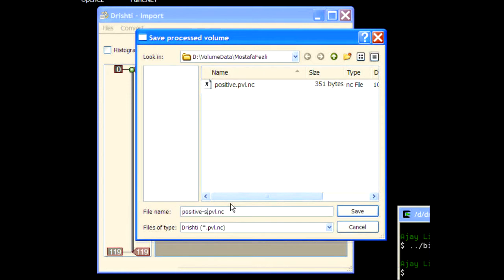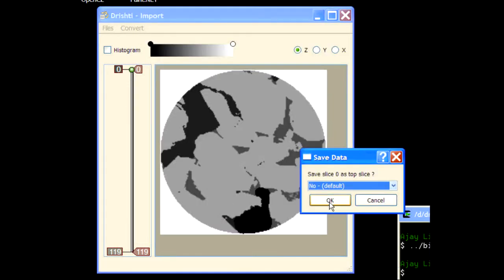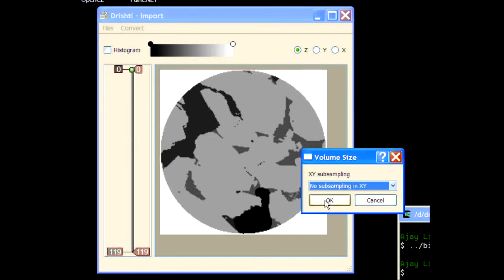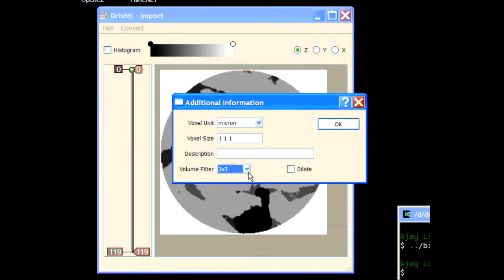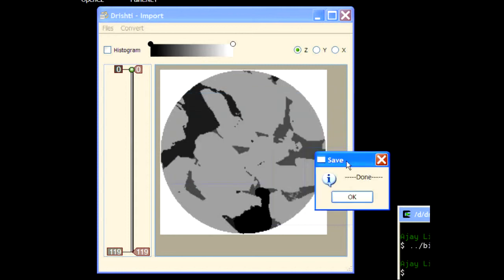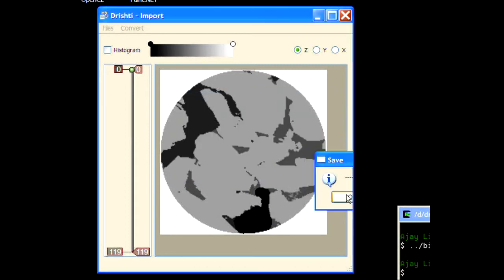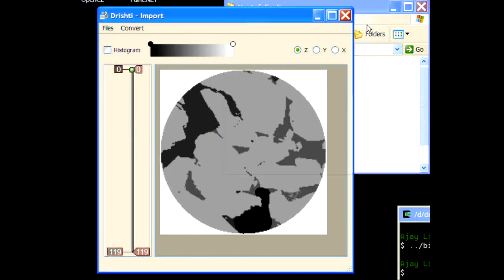Save positive, say smooth, if you want a smoother version. And then apply filter, say 3 by 3, 4 by 5, whatever. So once you have done that, you'll get a positive smooth file here.